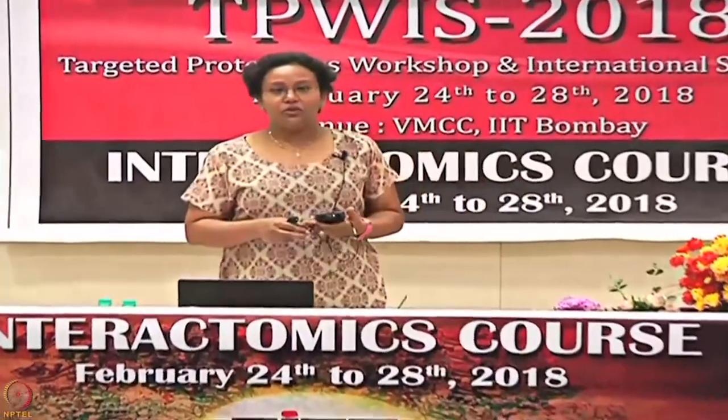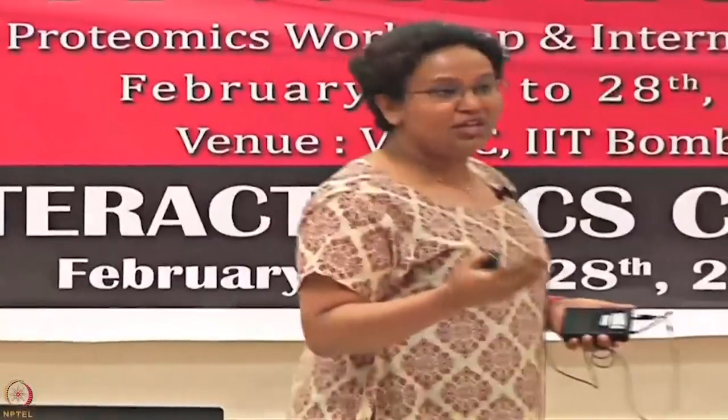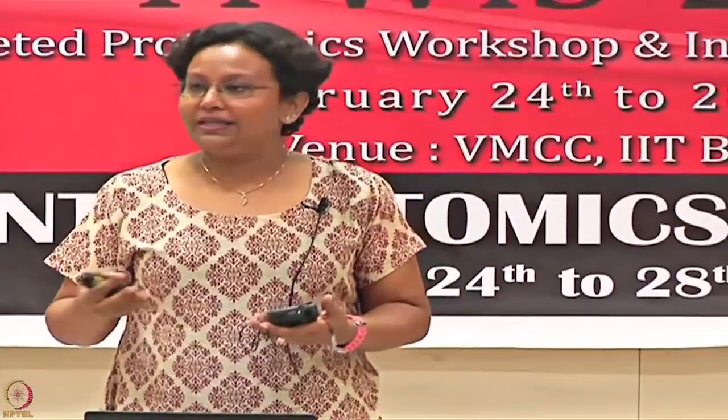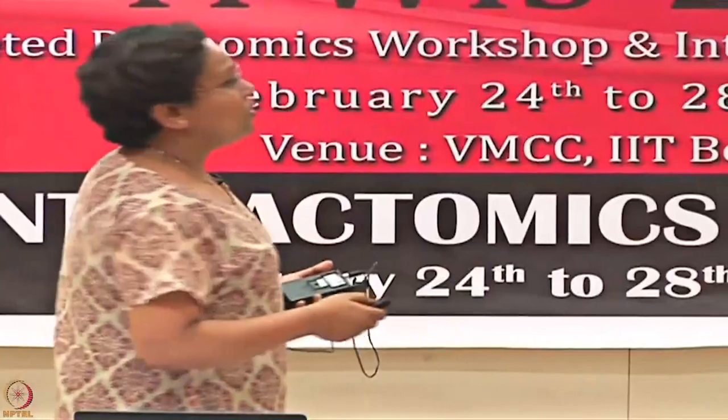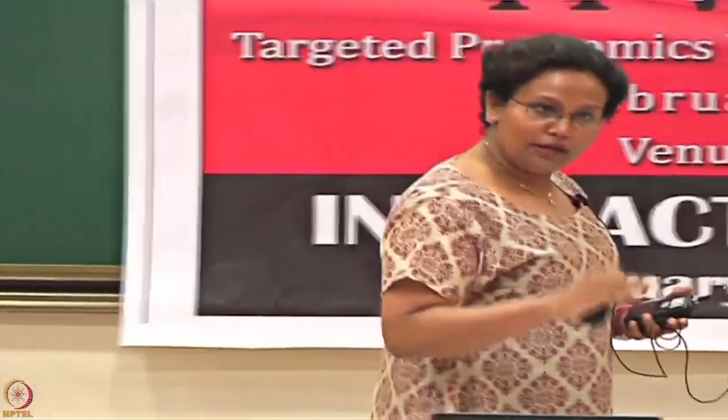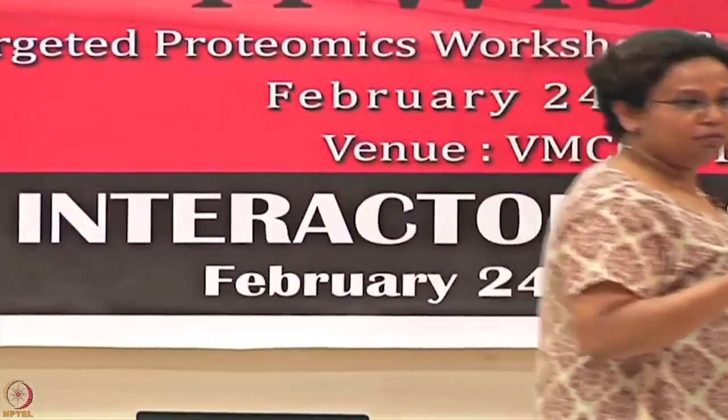The logic here is that when you are already attracting so much at pH 5.5, lowering the pH even further and attracting more doesn't really help covalent linkage. That's where you start getting steric hindrance, and your covalent linkage is not happening in an ideal scenario. So the key thing is to have your proteins in a comfortable environment, close to where your proteins will be comfortable, and not stress them out in harsher conditions.